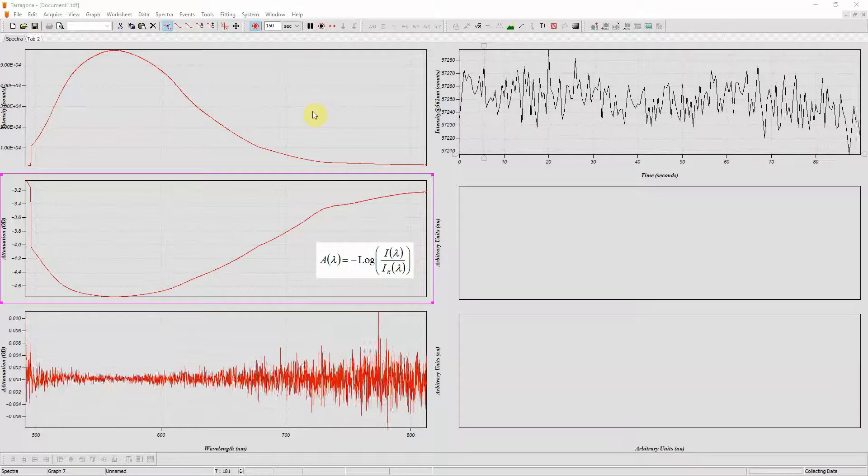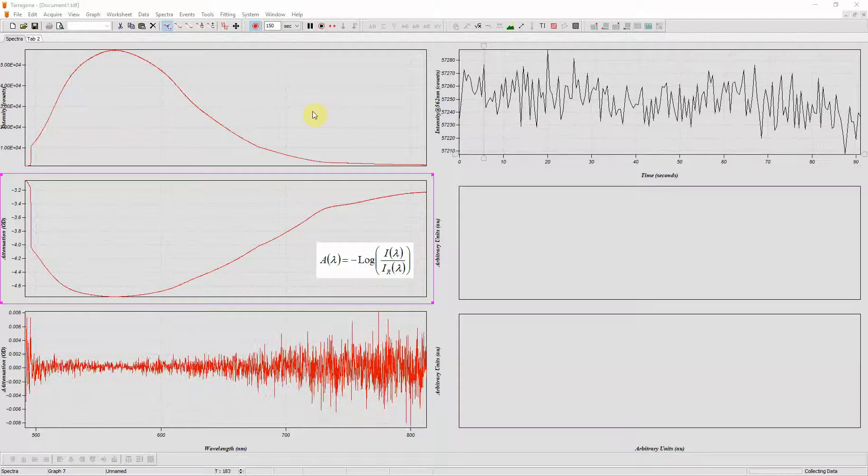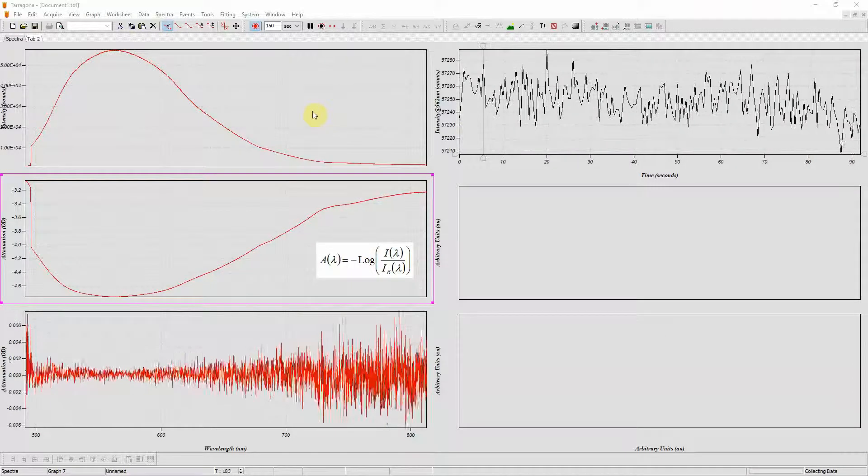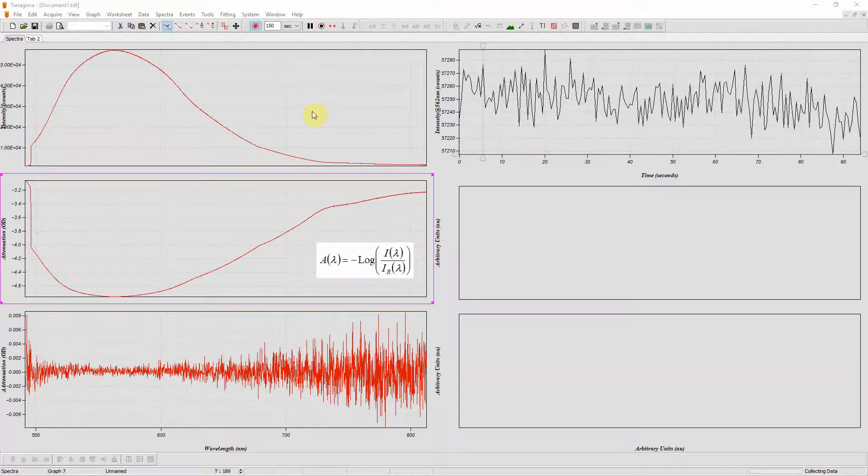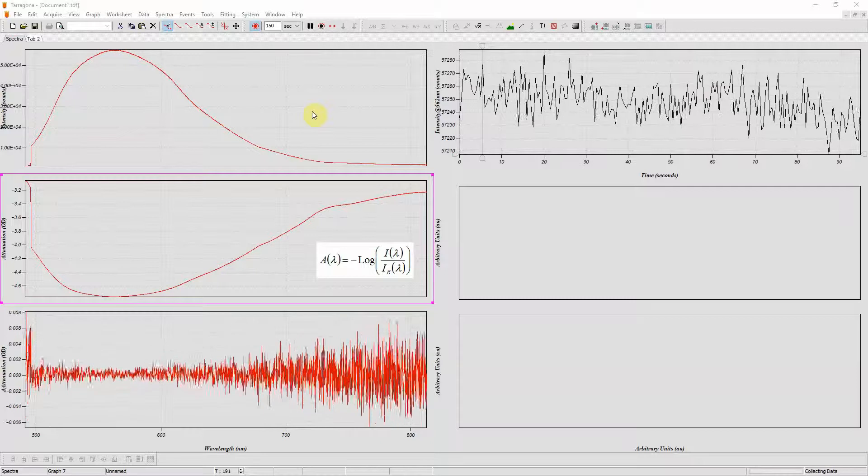Welcome to Tarragona from SalesSpecs. Today I'm going to show you how to intensity calibrate your spectrometer and talk about the black level.